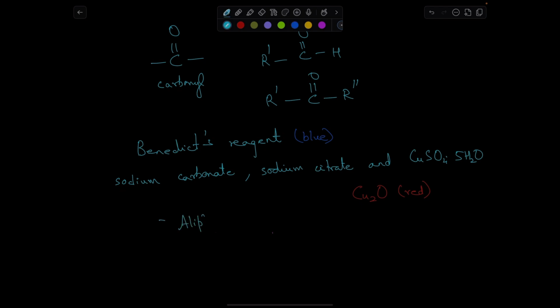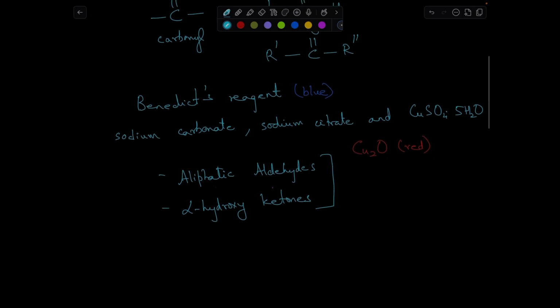Aliphatic aldehydes and alpha hydroxy ketones react with Benedict's reagent. If we have an aromatic aldehyde, it will not react, and ketones also do not react. So the first example we have is acetone. Acetone is a ketone, so no reaction with Benedict's reagent.